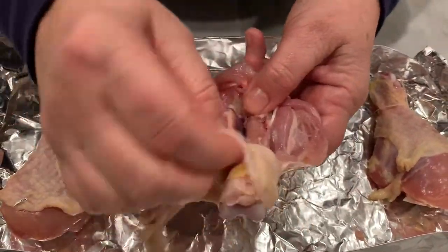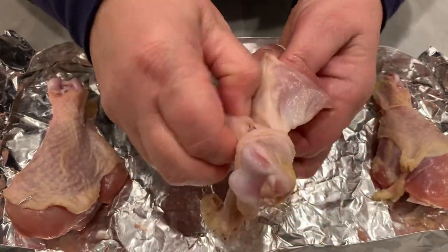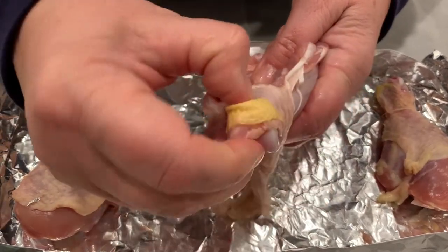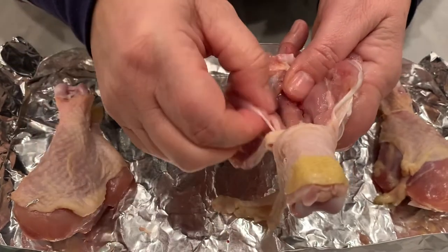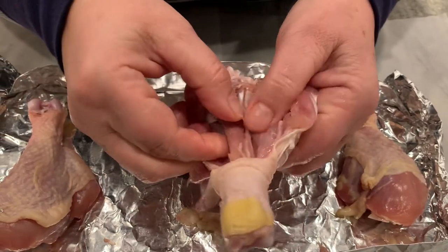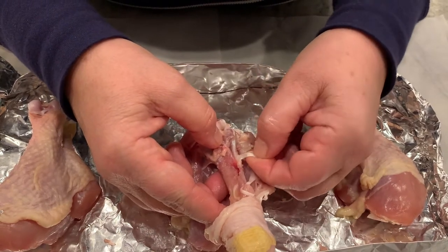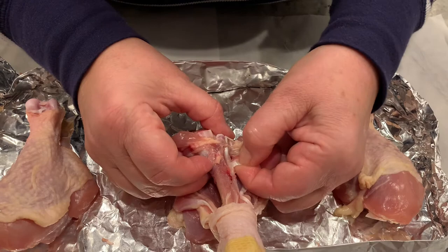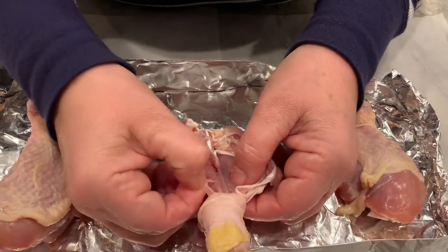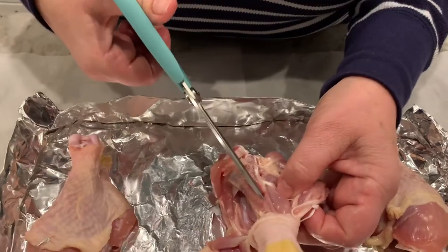Remember that muscles pull — they do not push. When you contract a muscle it causes the joint distal to it to move, so this would be extension and flexion of the lower extremity as the tendons pull on that joint. Right here is a tendon connected to the bone, and this is a nerve fiber.